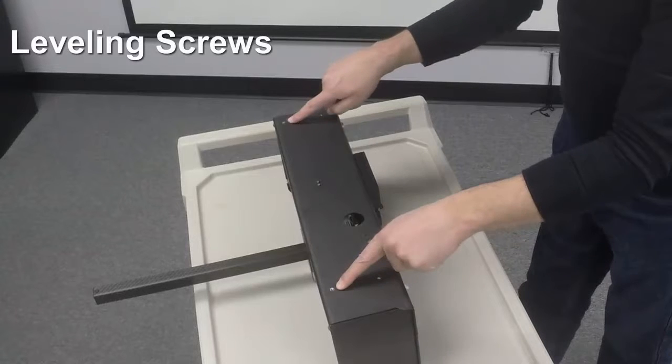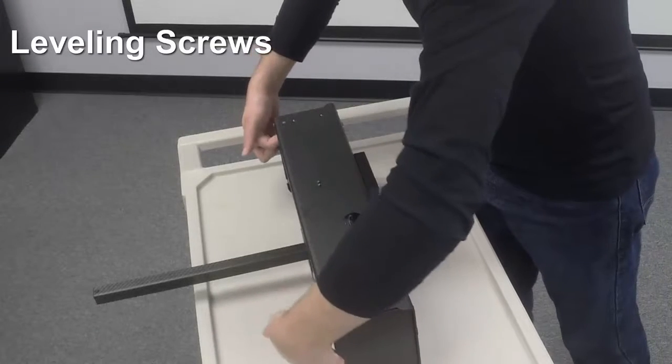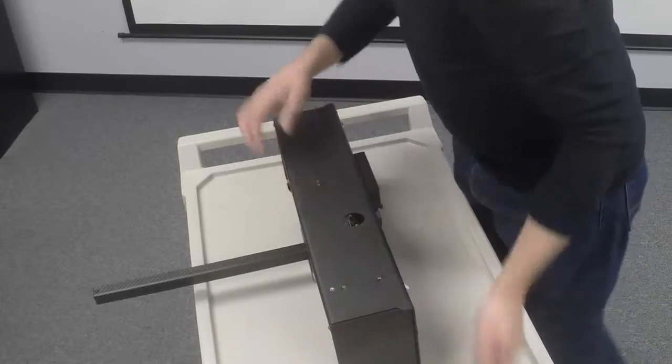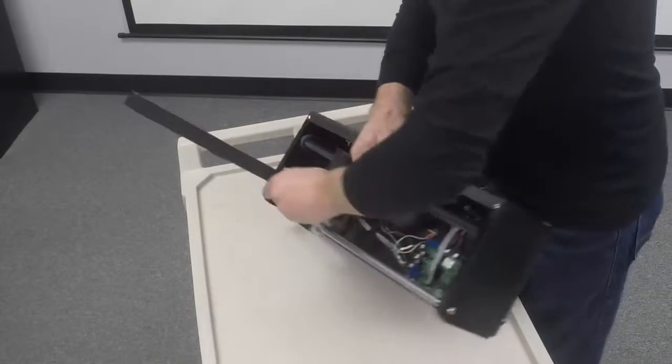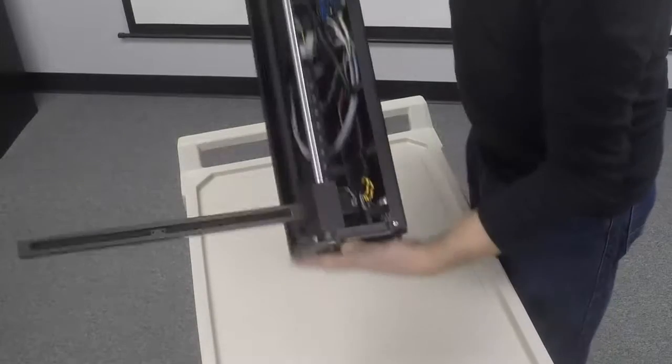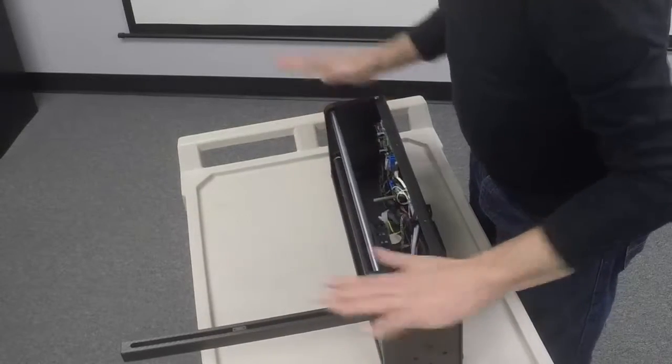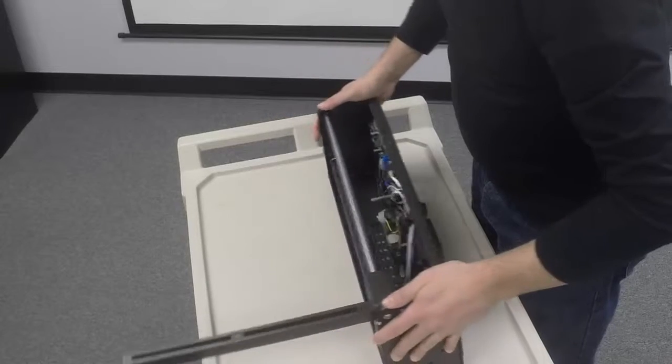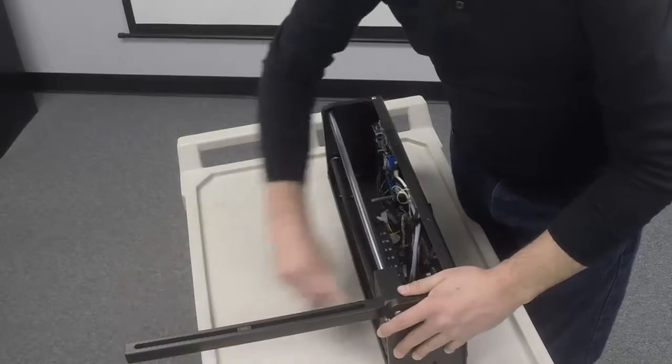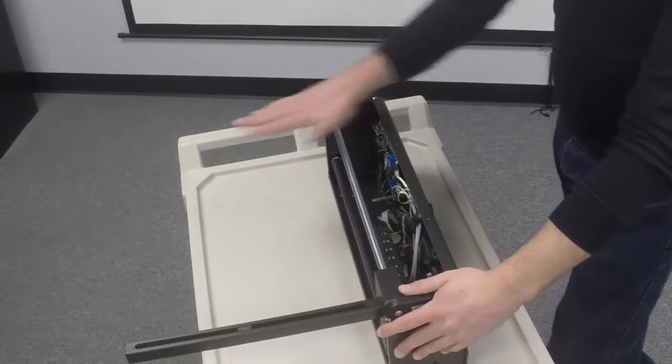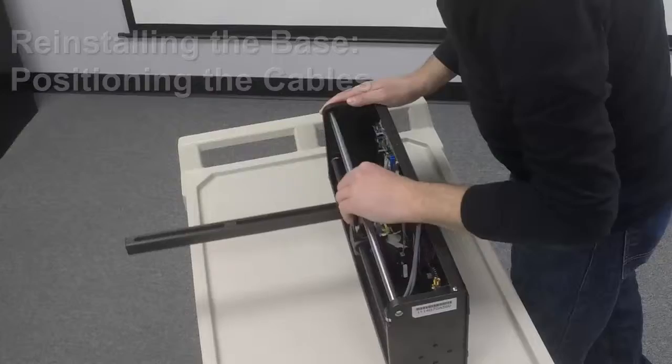On the top here, you can see the threads of the two leveling screws. These two points correspond to thumb screws on the bottom. The leveling screws put pressure on the base so that the alignment is parallel between the head and the base in the Y direction. These screws normally do not need to be adjusted.